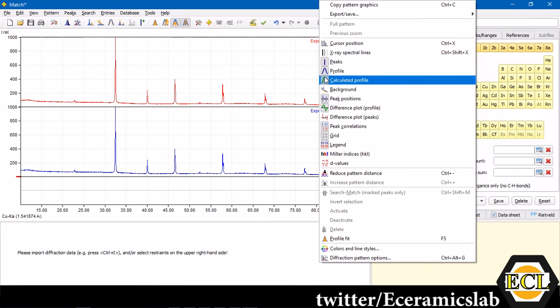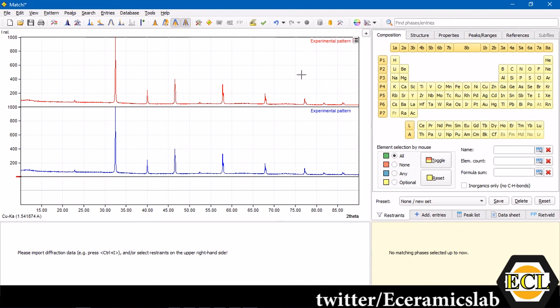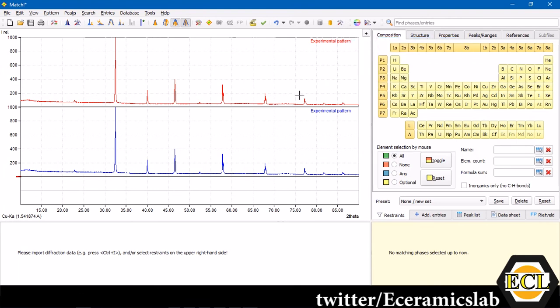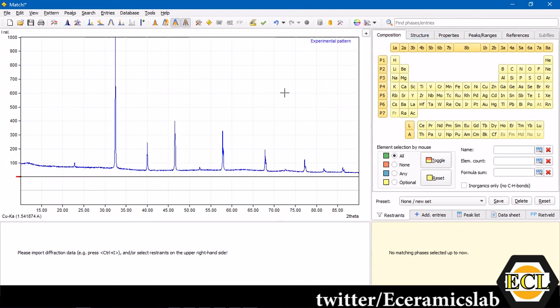Here I have a strontium titanate powder diffraction data in xrdml format. I'll drag and drop it over MATCH. This is your data which has been already plotted. This is the two theta and this is the arbitrary intensity.